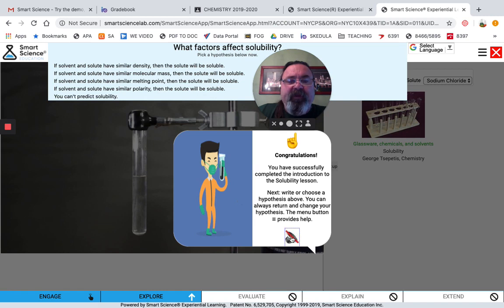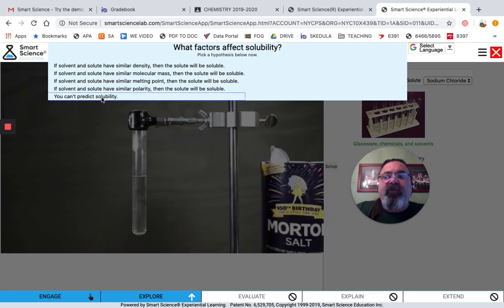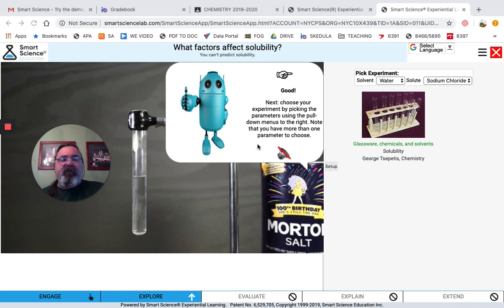Congratulations! You have successfully completed the introduction to the solubility lesson. Next, I'm going to pick or write a hypothesis. You can always return and change your hypothesis. The menu button provides help, so again, it's all discussed for you there. Now to pick the experiment here, I'm going to go ahead and pick this experiment.